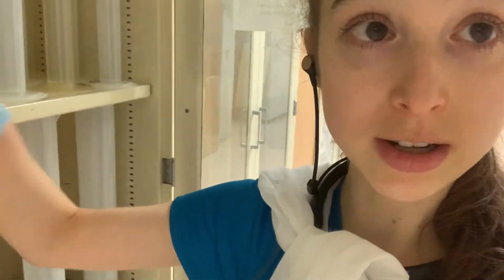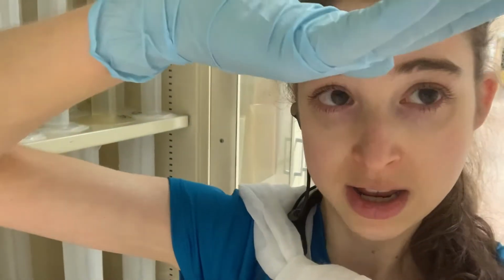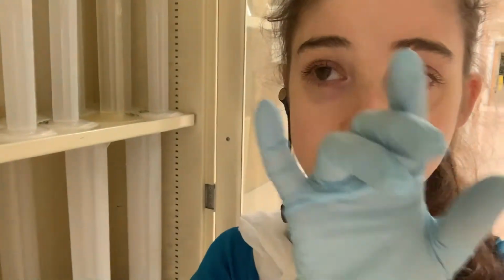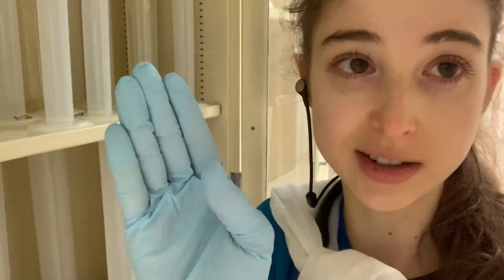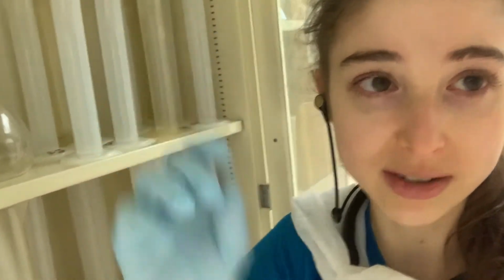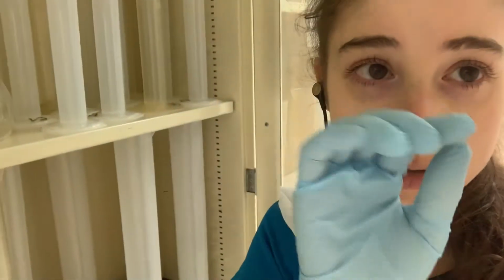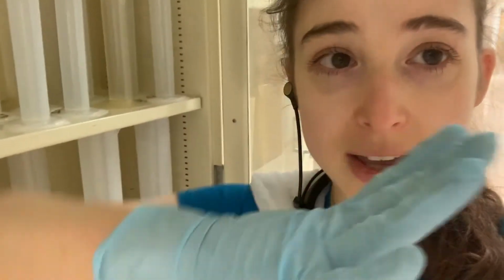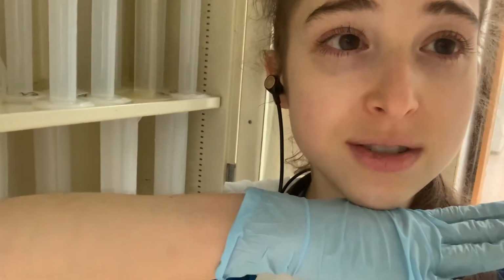And remember when you're measuring, you measure from the meniscus. If you're looking at it straight on, the liquid is going to curl up the sides, because the water sticks onto the surface, and it pulls up as it's dragging along the surface. It's attracted to the surface and pulling up, and it's pulling the rest of the water with it, because the water is attracted to other water. So basically that's why you get that meniscus. And you want the bottom of the meniscus to be on the line. Like if my chin was the meniscus, I'd want the chin to be on the line, measure like that.